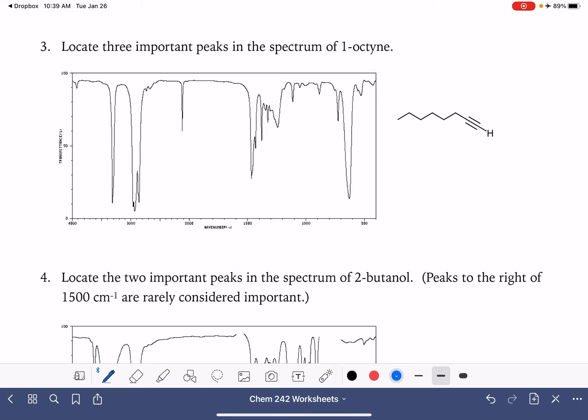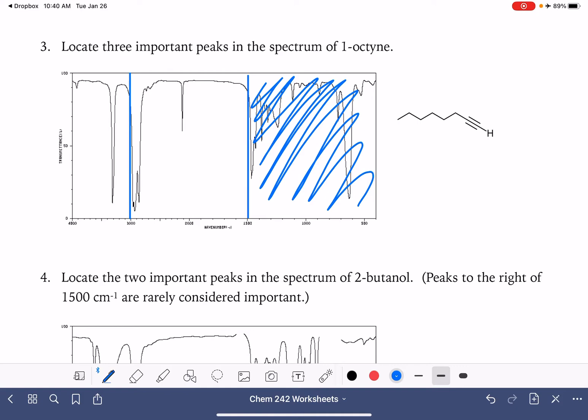Let's see what we have next. So here we have an alkyne and we want to look for the three important peaks in this particular spectrum. So let's practice this drawing the line situation. Here's our 1500 mark. We're going to ignore all of these things right here. Also, here's our 3000 wave number mark. So we have a peak to the left of 3000. That's a special hydrogen. A strong, sharp, pointy peak on this side of the spectrum is an indication of the hydrogen at the end of a terminal alkyne, this guy right there. We also have, of course, our standard regular carbon hydrogen peaks. And then we have this little guy, a carbon-carbon triple bond.